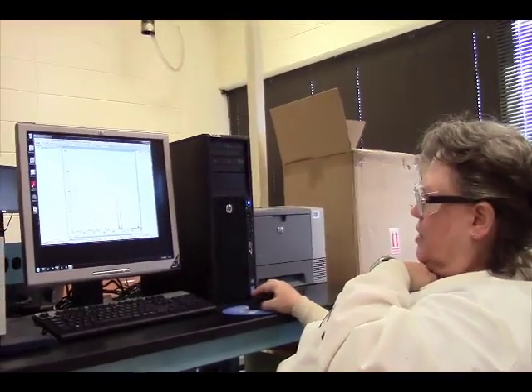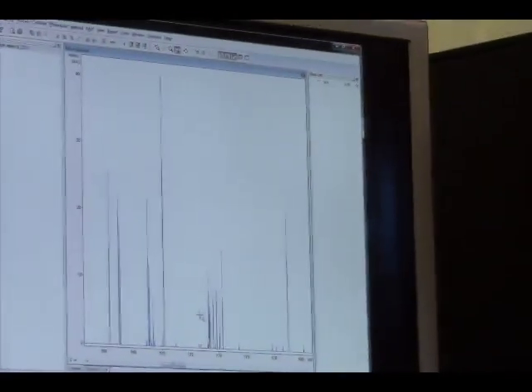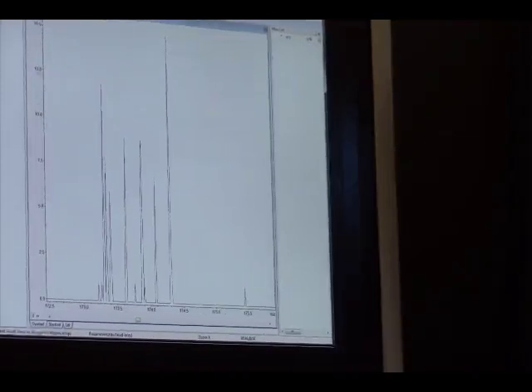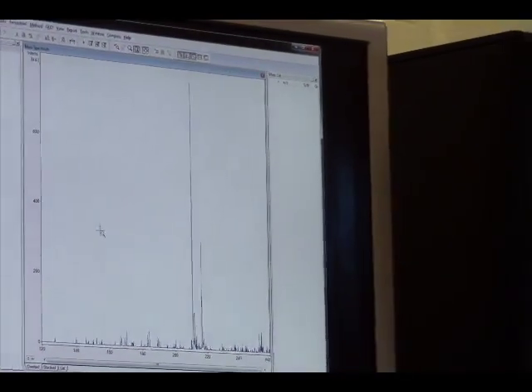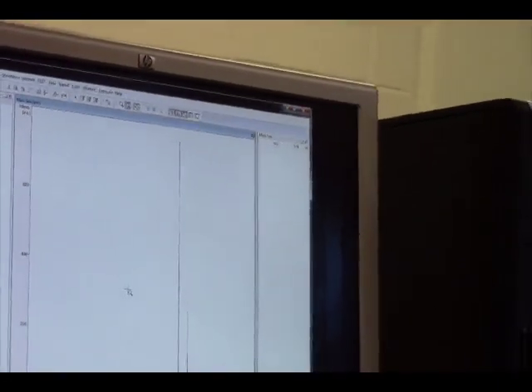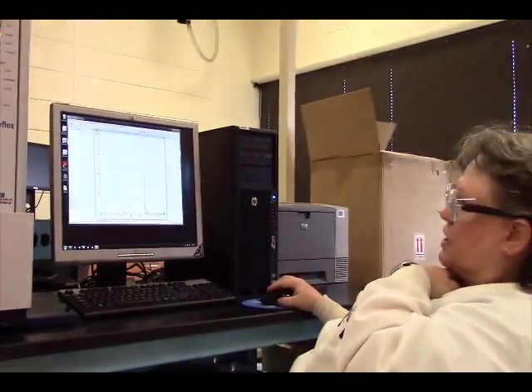Let's come back in here and look to see if we can find anything in this range. So we have nothing. What's our regular one? This is just noise. I don't have anything. There's really nothing for me to print out for this. So, let's look at our next one.